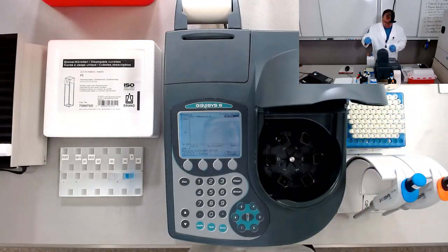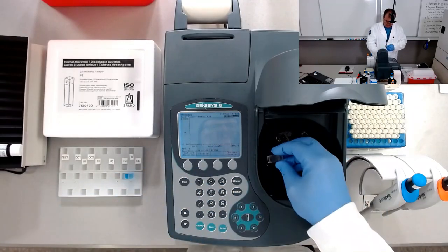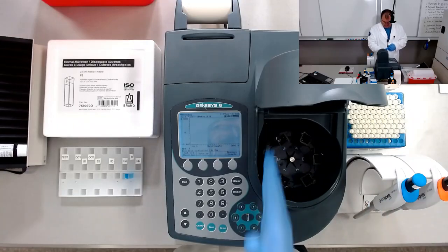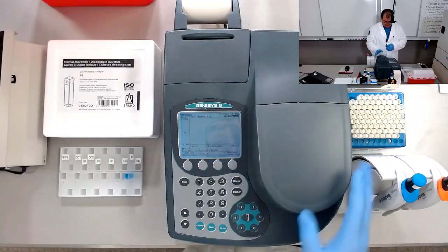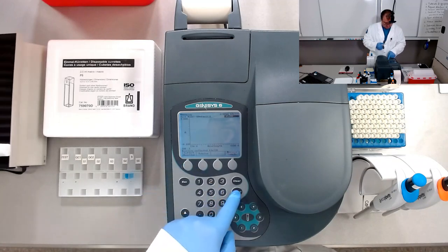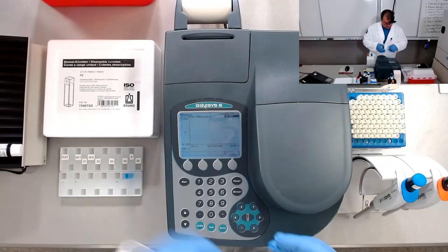Position the blank in there. We are going to take the cuvette and place it in the blanking position here. The light beam comes this way. Okay, blank, collect the baseline.